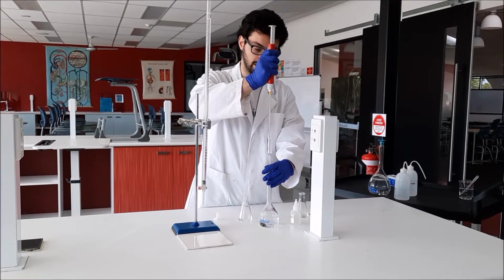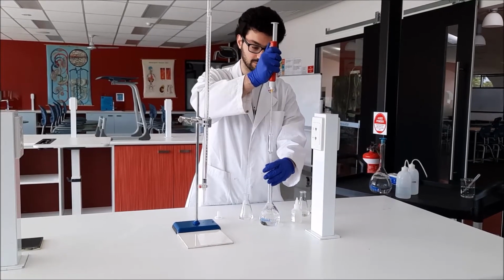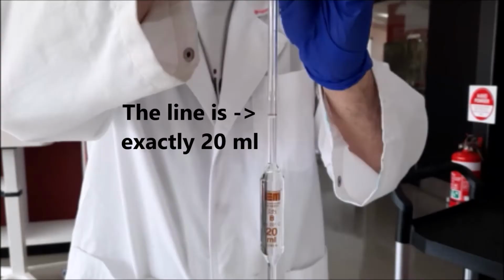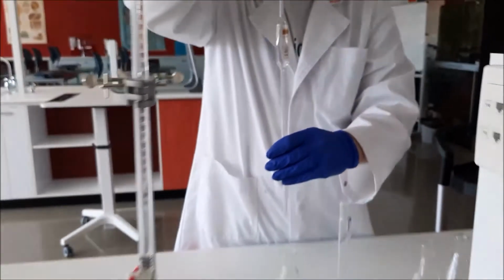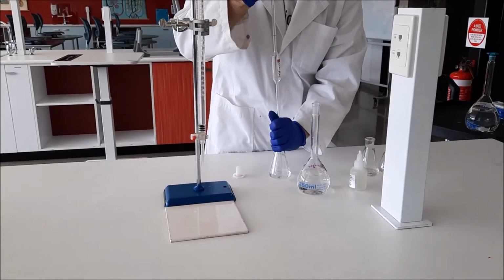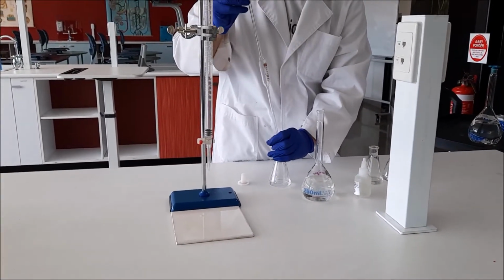And what you want to do is get it as close to the line as possible. So once you have that, we're going to put it on top and we're going to release all that liquid into our conical flask.